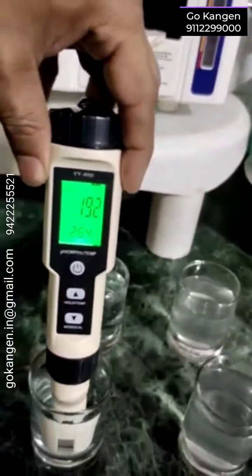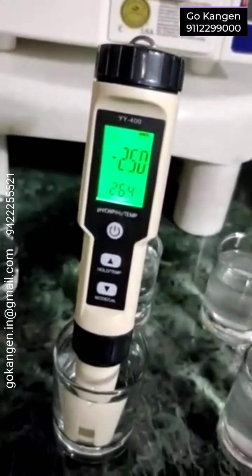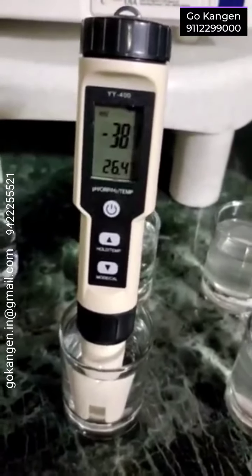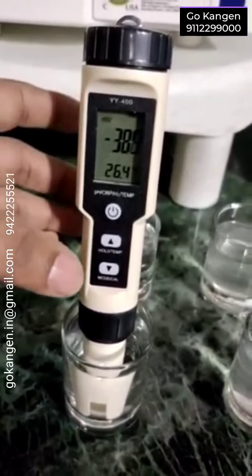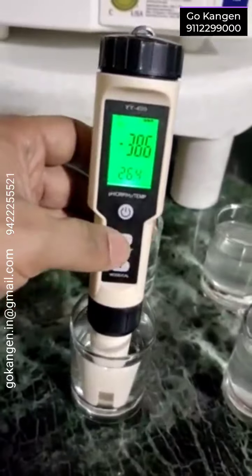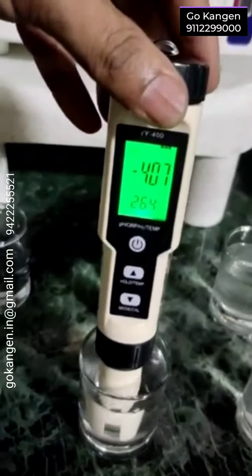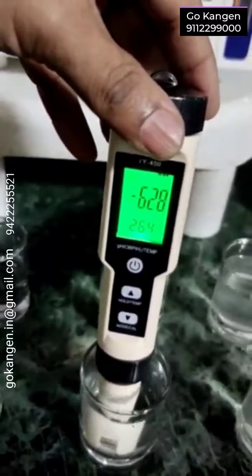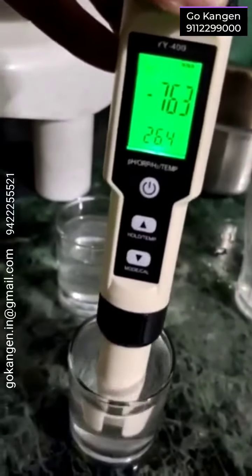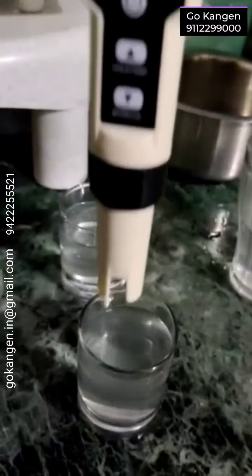This is 9.5. You can see — positive. This is 11.5. Again, minus.